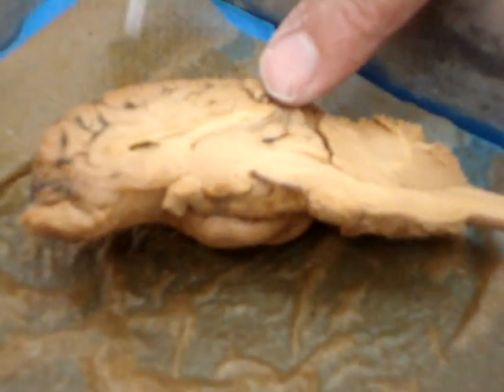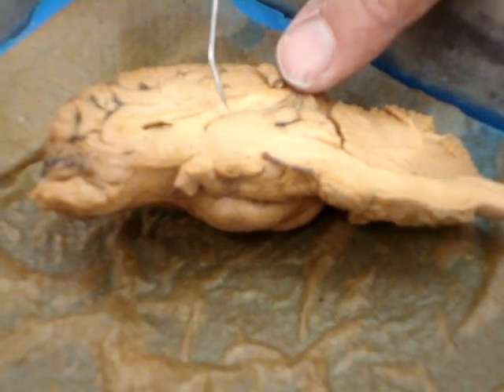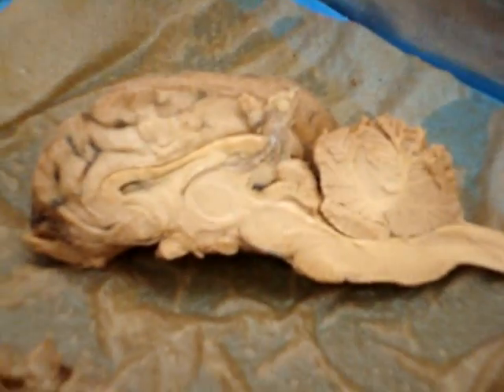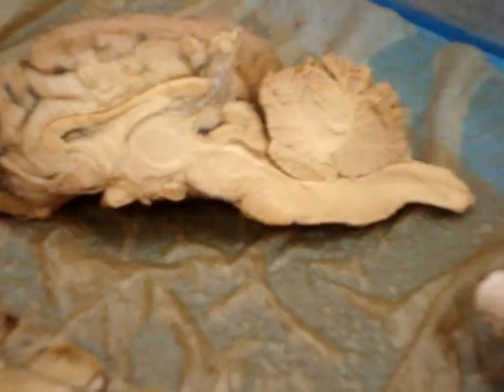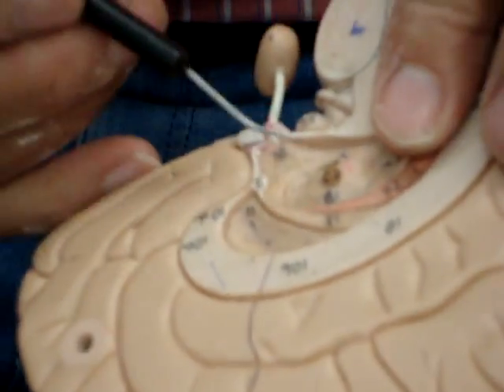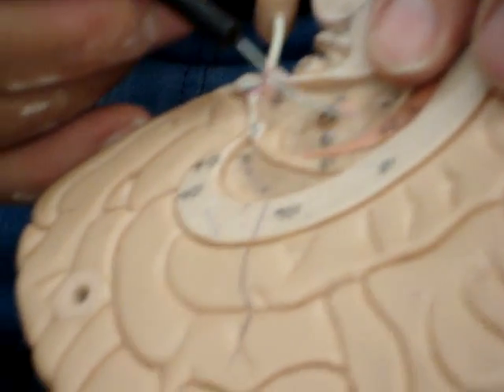Let's bring these over. I'm not touching it with my bare hand. This is a round circular structure. Can't see it on here. If you called it thalamus, I wouldn't mark it wrong. The intermediate mass of the thalamus is actually the brown area. All of this is thalamus. I wouldn't mark it wrong.